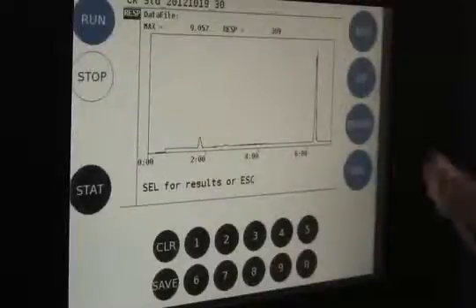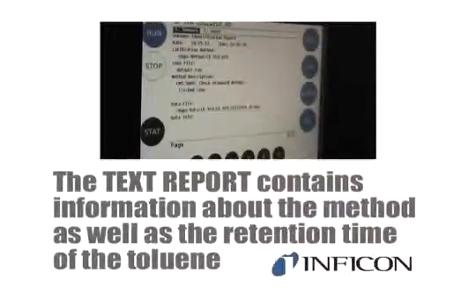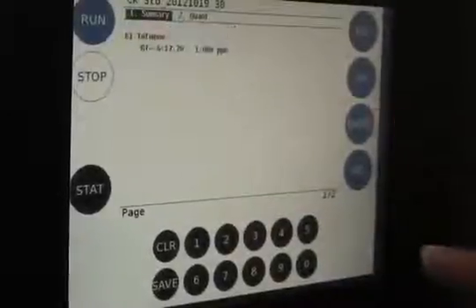After the run, touch Select to view the quantitation report. The chromatogram or text report can be viewed from the front panel. The text report contains information about the method as well as the retention time of the toluene.